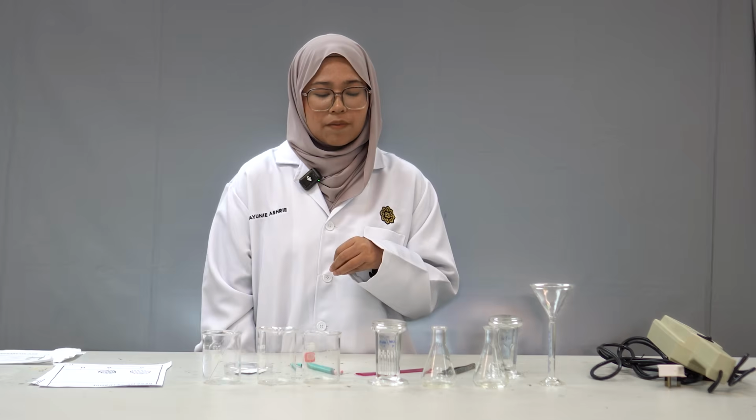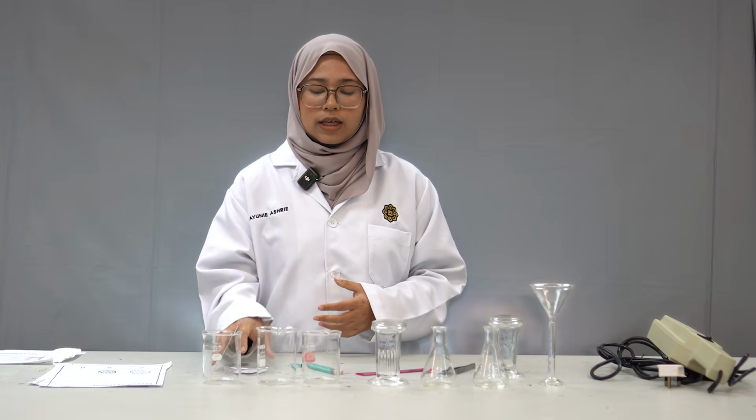And then for precautions to ensure that this experiment gets good and reliable results: First, make sure to label all samples correctly to avoid any confusion later in the experiment. And second, make sure the TLC plate is clean and dry, because if it's dirty or has any fingerprints on it, it will make the solvent not move evenly.